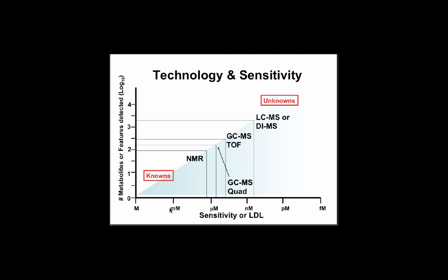And so it's often hard to write papers about unknown things. However, in LCMS, there's the opportunity for new discoveries, and so that's particularly appealing. Whereas in NMR, discovery is mostly based on whether things change in intensity or concentrations rather than identifying brand new compounds. GCMS is right in the middle, where it's getting a nice mix of both knowns and unknowns. But generally, there's far more knowns that you see in GCMS, and so that, too, is quite appealing.